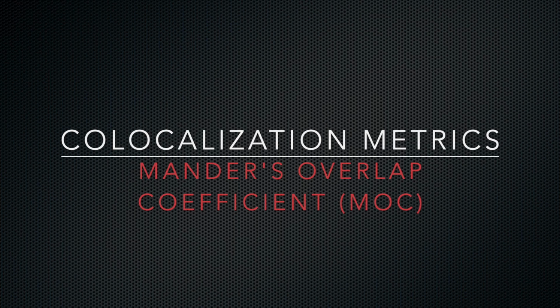Okay, now let's go to another widely used metric, that is Manders overlap coefficient, or MOC, commonly referred to as Manders, although you'll hear in a bit that we have to be careful when we say Manders, to what we mean by that.